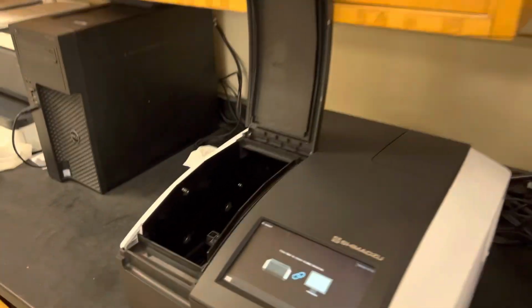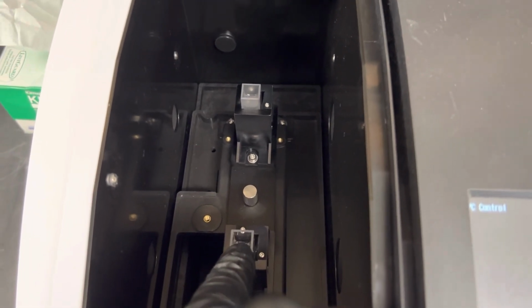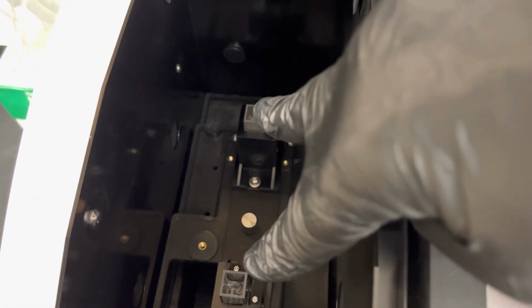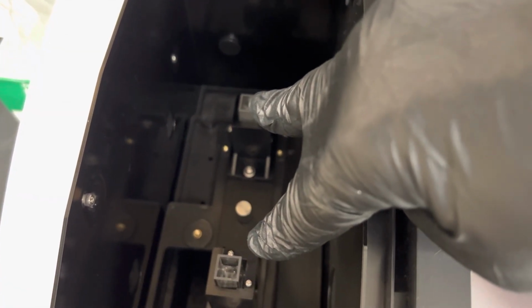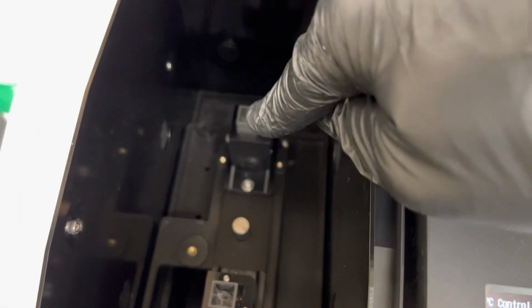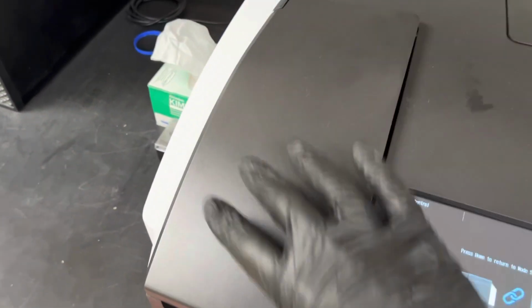Okay, I've already put the sample in. And the sample goes in the first spot. You keep the blank there. So at the beginning you had 2 blanks. Once you zeroed it out and you read the blanks, you take this one out and that's gonna be your sample. A blank stays in all the time. Broke the machine.